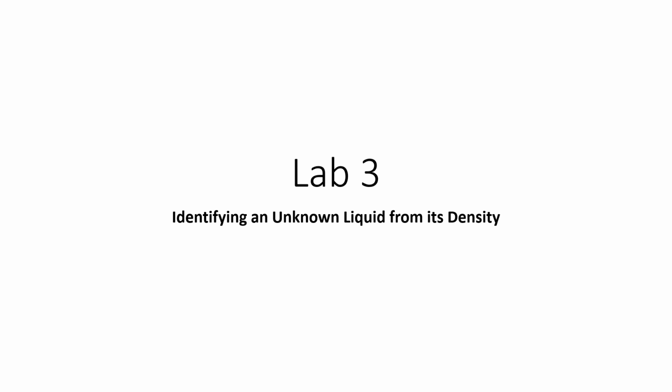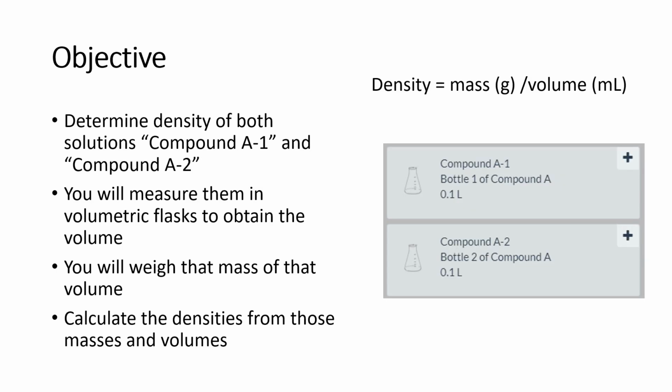So in this lab, we are going to be identifying an unknown liquid from its density. Conceptually, and how this relates to what you're learning in lecture has to do with the idea that we can use densities to identify liquids, or we can calculate the mass, we can calculate the volume, we can calculate whatever we need.